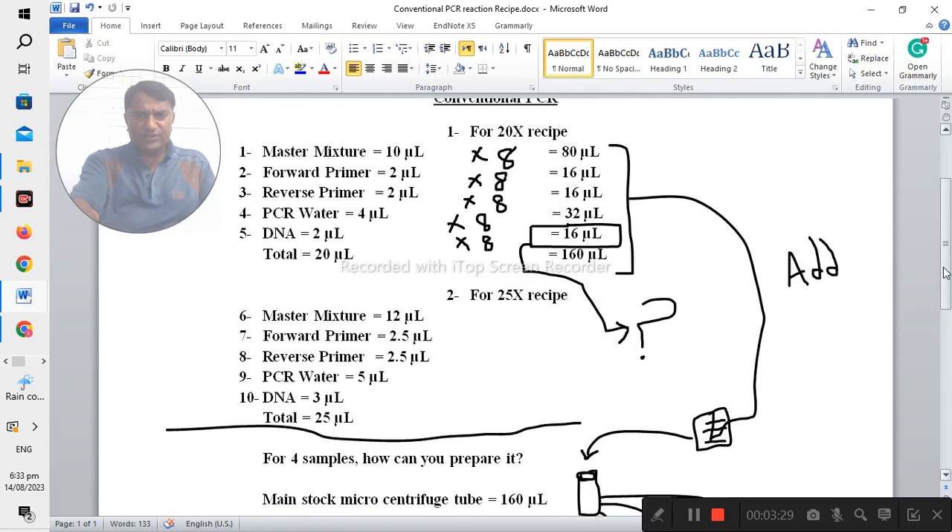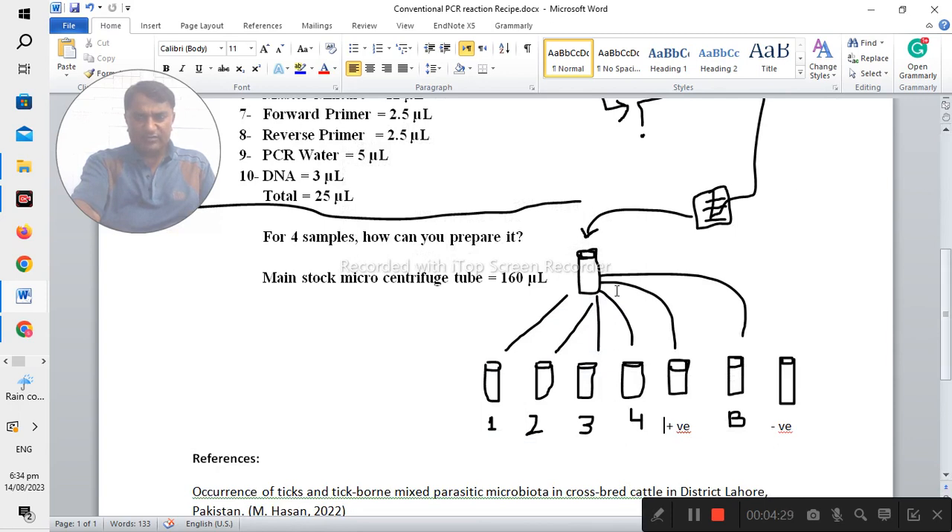If you would like to prepare the 20x recipe, you should multiply each chemical by eight: master mix becomes 80 microliters, forward primer 16 microliters, reverse primer 16 microliters, and PCR water 32 microliters — giving a total of 160 microliters. It is important that you should not add the DNA or sample at this stage. Combine all other items into one PCR centrifuge tube, then add 18 microliters from this mixture into each individual tube.